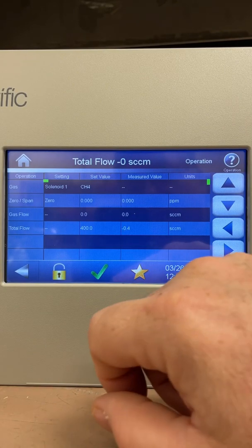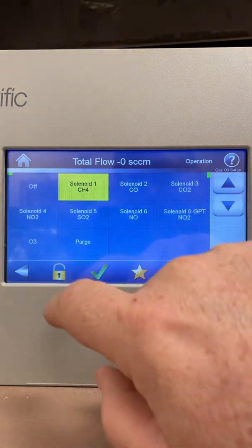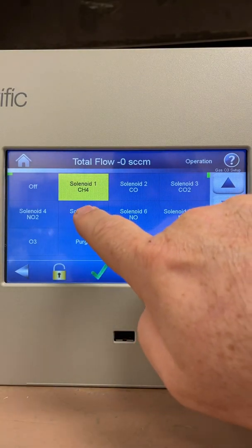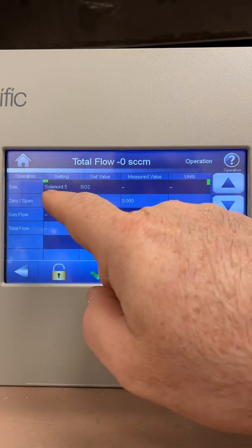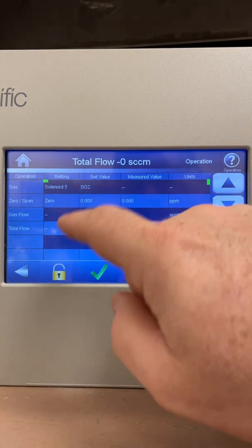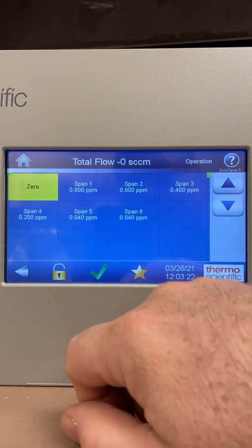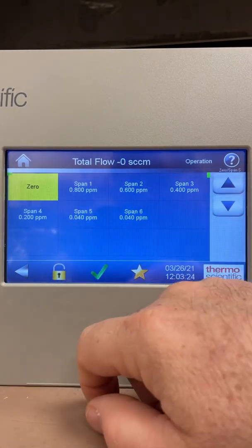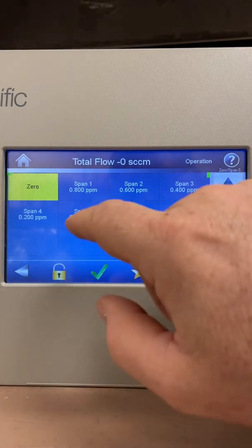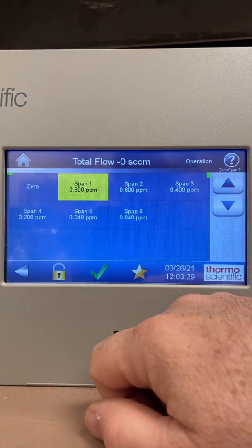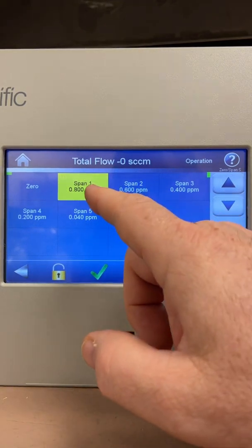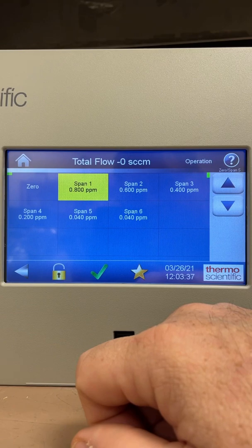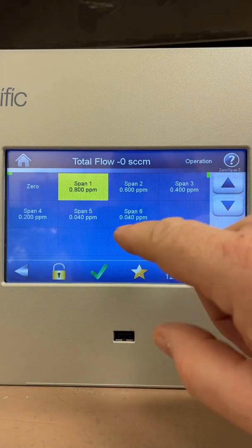That's how simple it is — just pick your solenoid that your cal gas tank is on. For SO2, for example, solenoid 5 shows under Settings as solenoid 5 SO2. I'm running zero air right now, so I want to take it into span 1. My high point is 0.8 ppm or 800 ppb. I'll press span 1, hear a click, and my cylinder opens up into that span 1 port and I let that run for 15 minutes calibrating my SO2 analyzer.